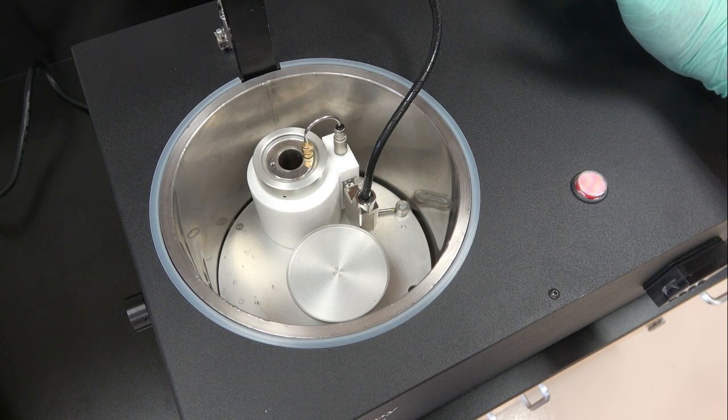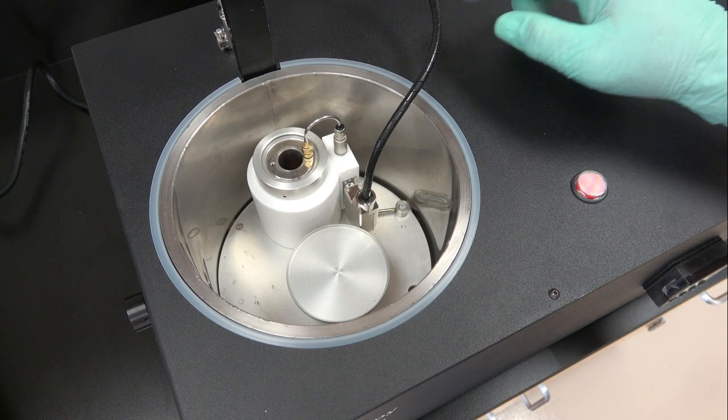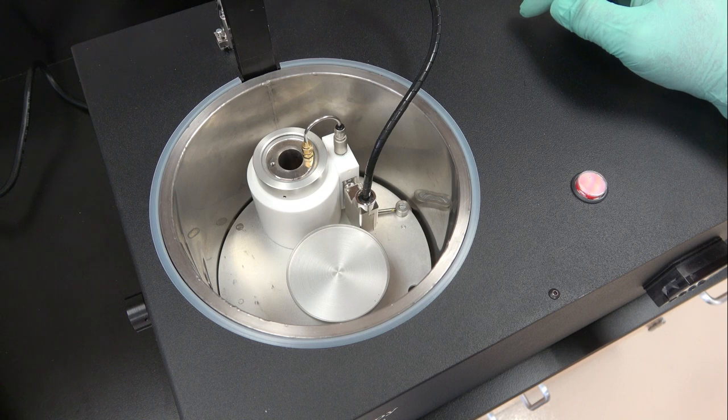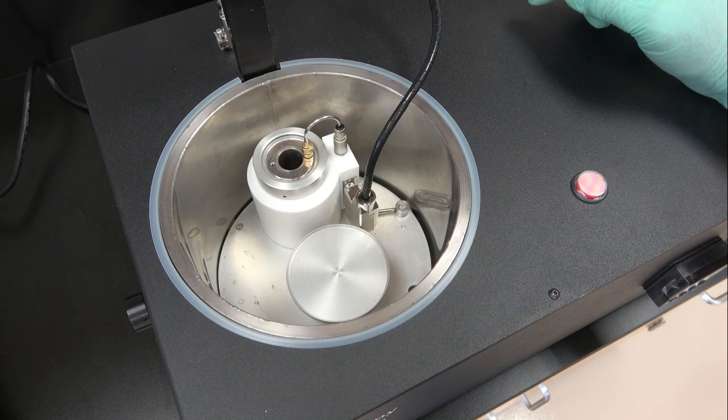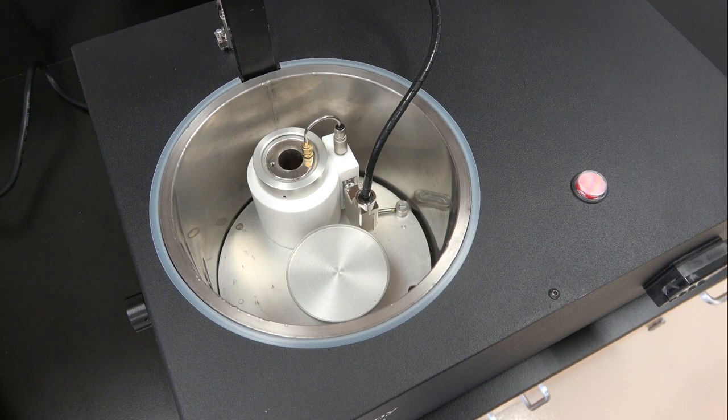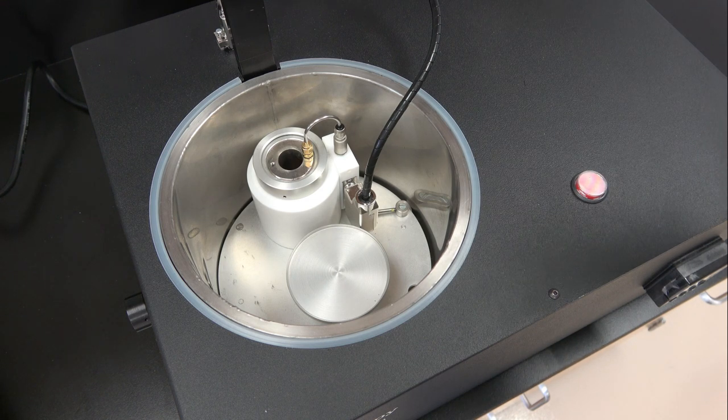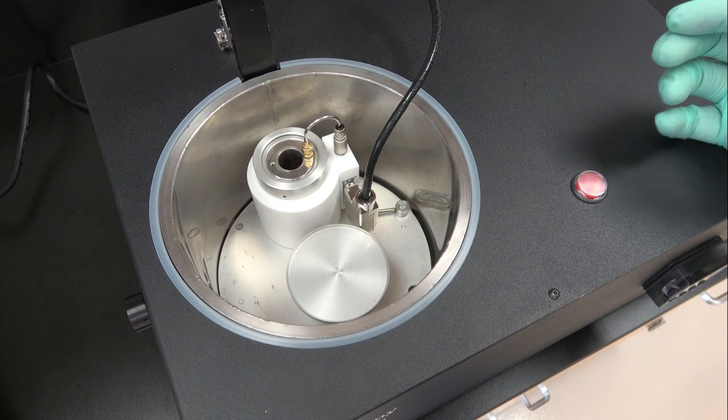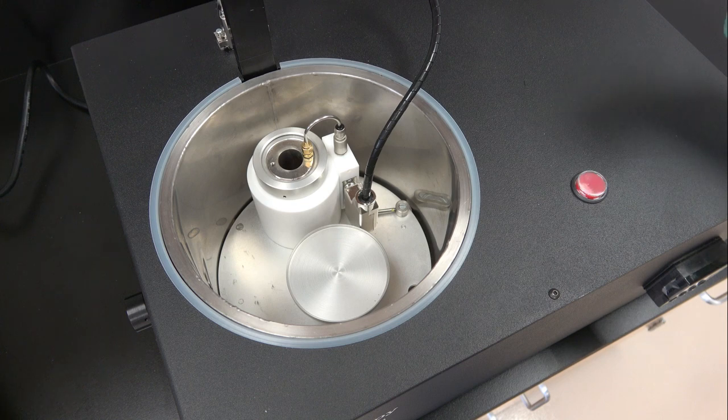When the temperature is below minus 140, you can then start to introduce your cryogen into the condensation chamber, and once it's full and your temperature is stable at either ethane or propane temperature, whatever you're working with, you can go ahead and proceed to freeze.